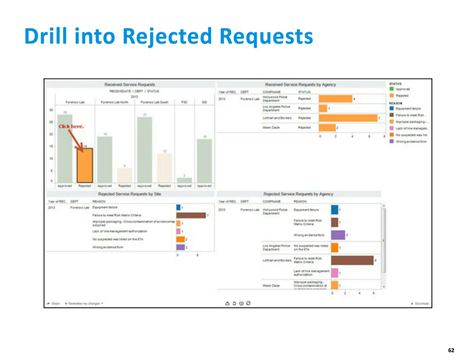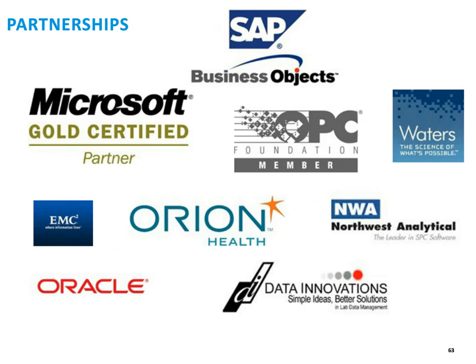What partners does the vendor you're considering working with have? So if you're considering a given vendor, you want to ask yourself, who are their partners? Because if they're working with really reputable, leading technology leaders out there in the field like Microsoft and Oracle, SQL, et cetera, then you can have some comfort that this is a good company to choose as my partner for my LIMS because they have good partners working with them and supporting them.